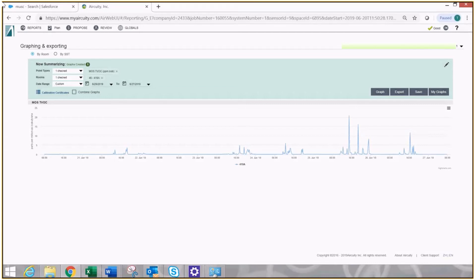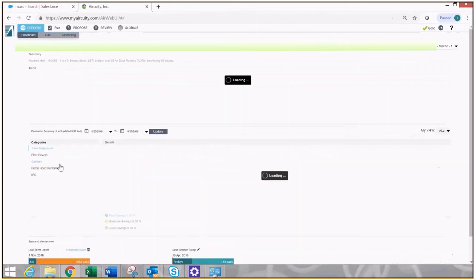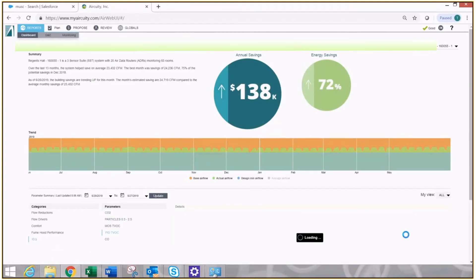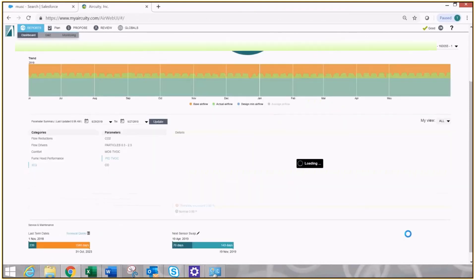Back to my dashboard. Back to my IEQ. Look at my last parameter, my photo ionization detector for total VOCs.